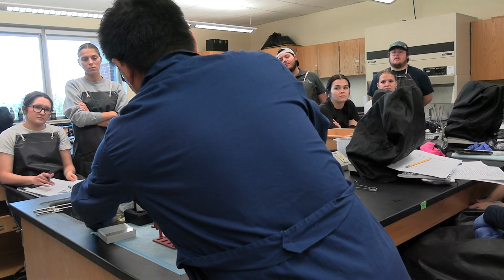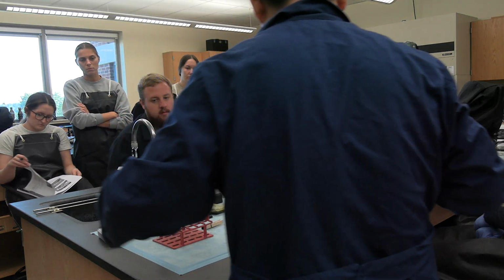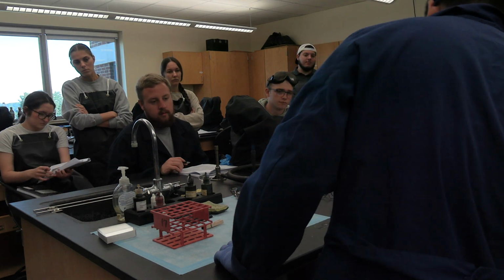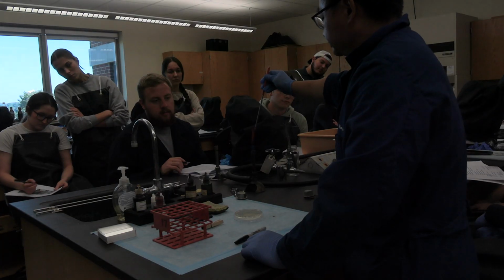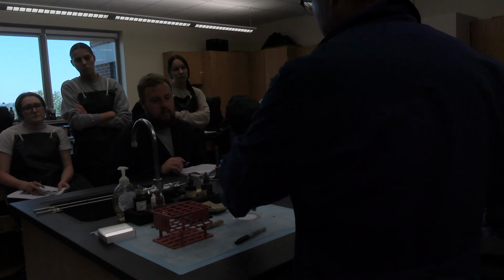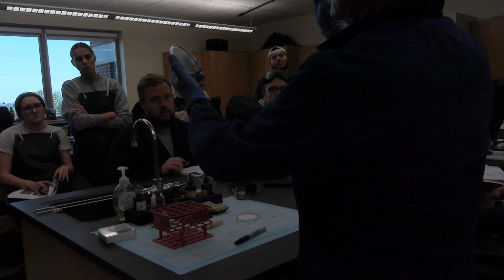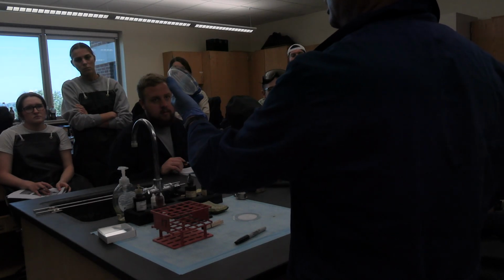A little bit of drip. How much water is good enough? Flame it again. It's very important. Now touch the bacteria on here, a little bit touching the surface of the agar.